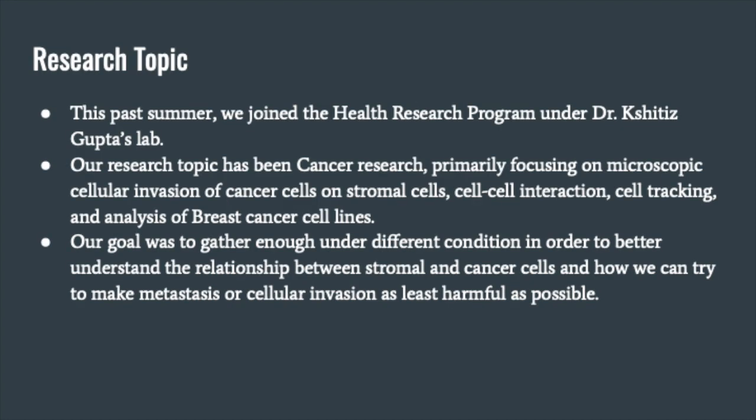This past summer, we joined the health research program under Dr. Kshitij's lab. Our topic was cancer research, primarily focusing on microscopic cellular invasion of cancer cells on stromal cells, cell-cell interaction, cell tracking, and much more. Our goal was to gather enough data in different conditions and understand the relationship between stromal cells and cancer cells and how we can prevent a less invasive metastatic state.